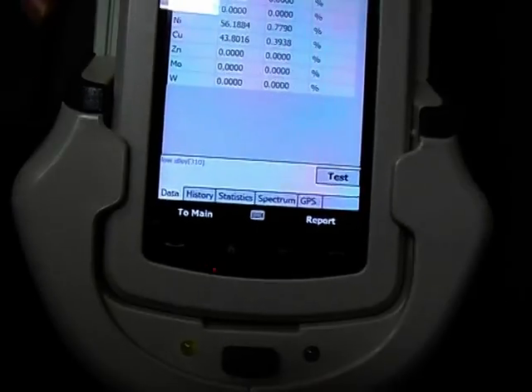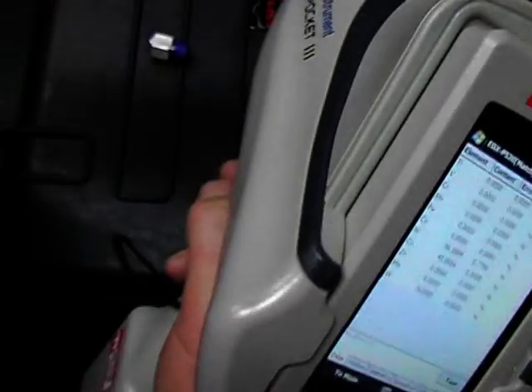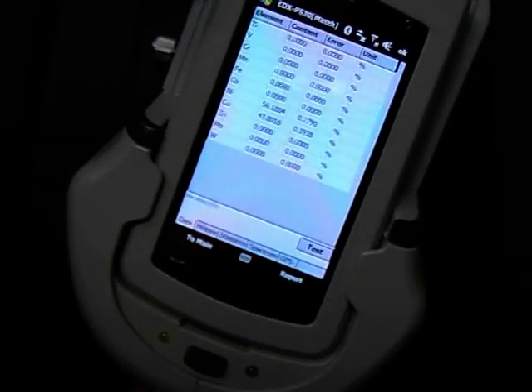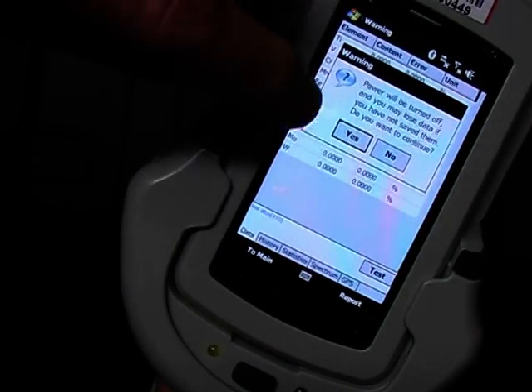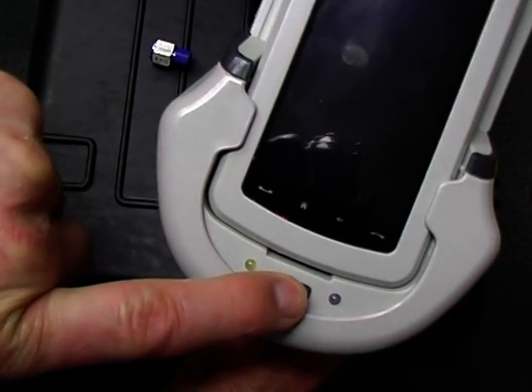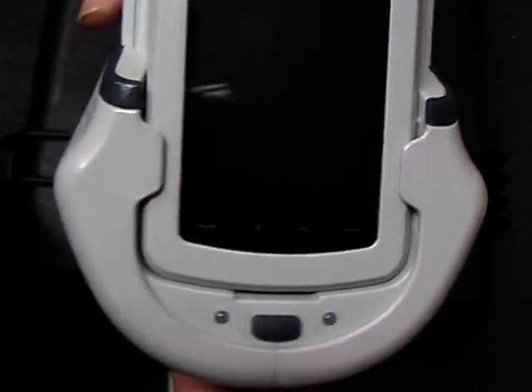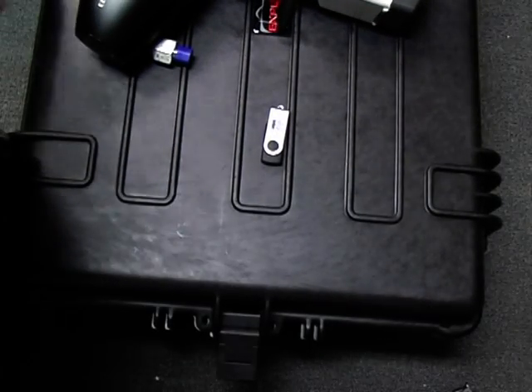This is matched to 310 stainless. To turn the instrument off when you're done, simply hold this button in here, and hold that button in there — when you hold it in, it requests: do you really want to turn it off? Yes. And push this button in to finish. Very simple to use.